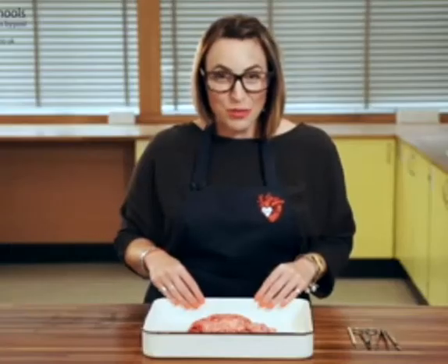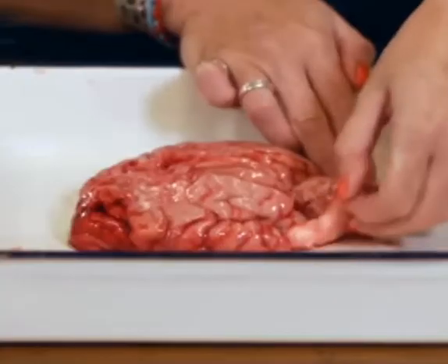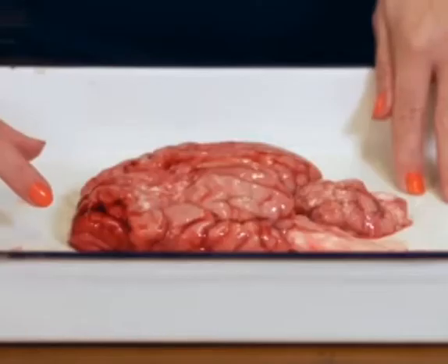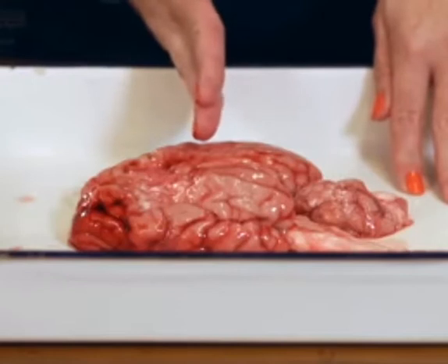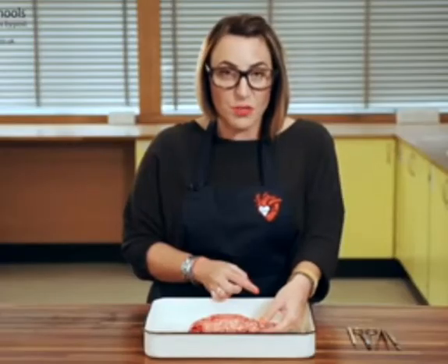So in your sample, you'll be able to identify the left and right hemispheres. You'll be able to see the hind region of the brain, which we refer to as the cerebellum, and a portion of brainstem attached. When we look at each region of the brain, going from front to back, at the front region of the head, we have what's called the frontal lobe, and this is responsible for thinking, planning, decision-making. Moving back across the brain, we have our parietal lobe, our occipital lobe, and at the back, this cerebellum. Sometimes this is referred to as hindbrain.